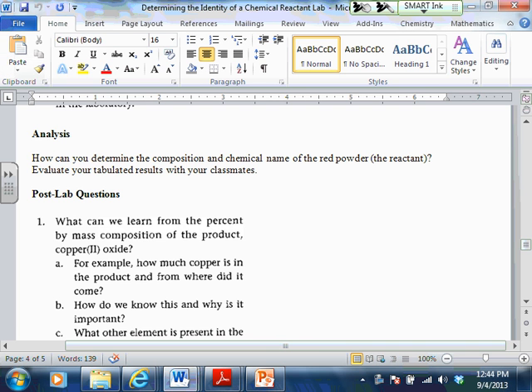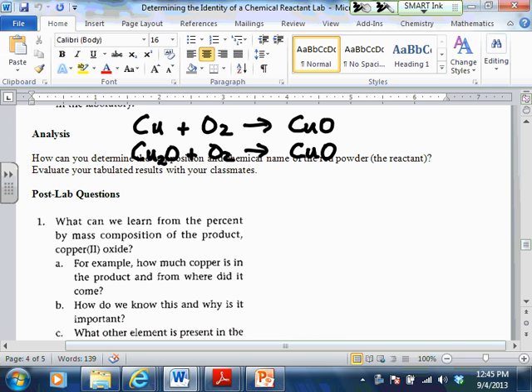But then we talked about there's 2 scenarios for the beginning reaction, all right? So it could have been Cu plus O2 yields CuO, and again, we'd have to balance that. I'm not going to worry about that right now. Or this could have been maybe Cu2O, if this is copper 1 oxide to begin with, plus O2 yields CuO. Either one of those scenarios is plausible, all right? So we've got to figure out which one of those actually occurred. Now, are there any ideas about something we could figure out that might help us with whether it's Cu or Cu2O at the beginning?